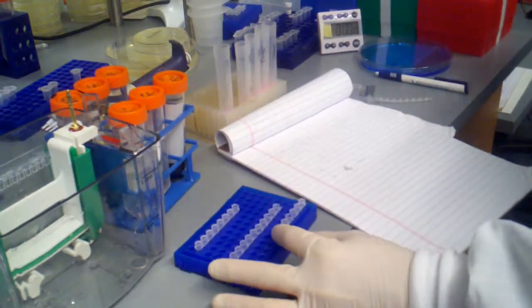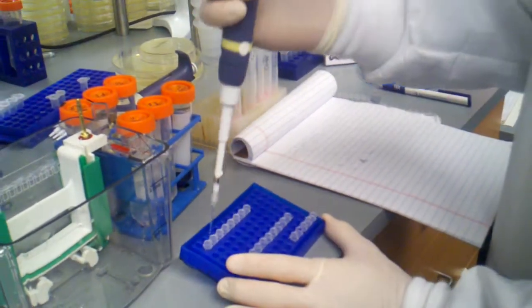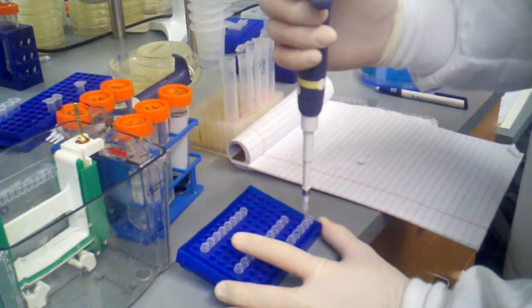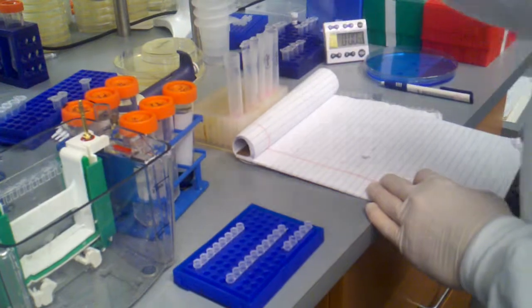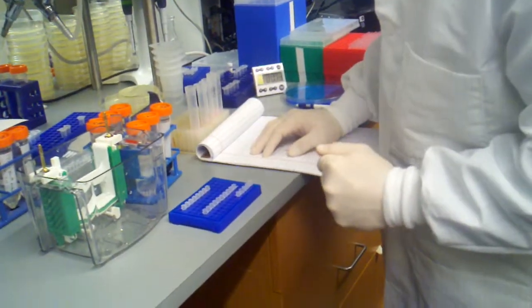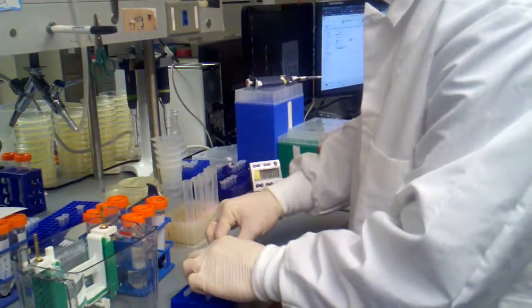And then I'm actually going to do a 6 microliter run of our Cree, because that is going to have the faintest signal if there is any signal. It's going to be the last one. And it would be good if I had a his tagged Cree so I could run it just to see what the pattern was. And I'm going to omit this for now, but we're going to come back to that a little bit later. So now that my samples are all aliquoted, I'm going to do a couple of things.